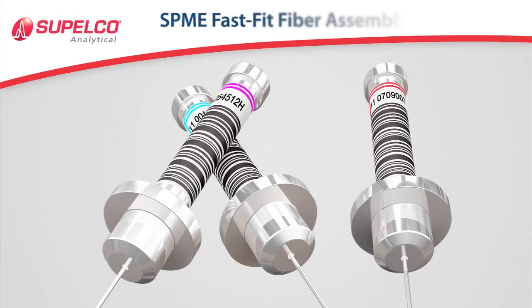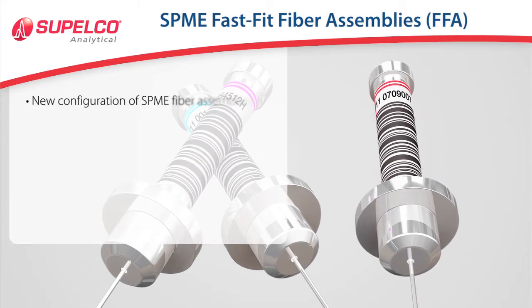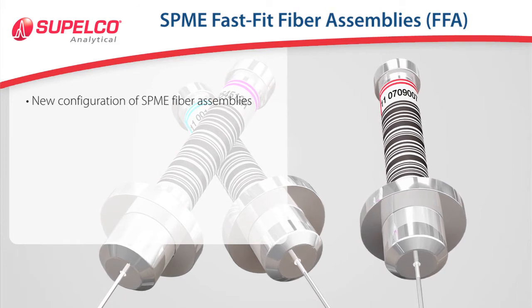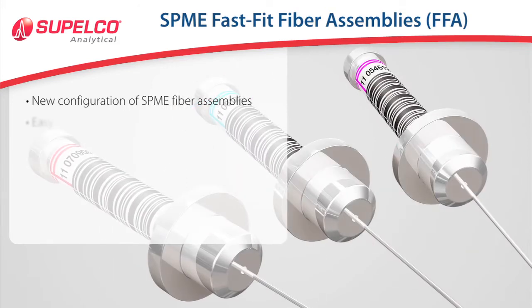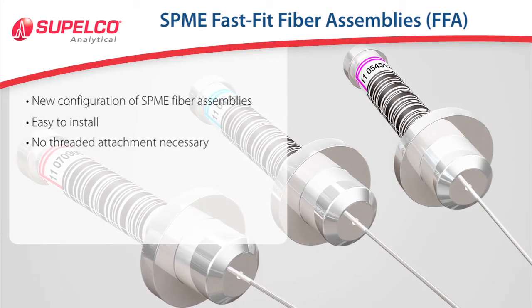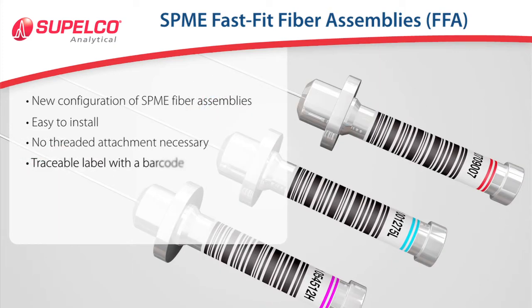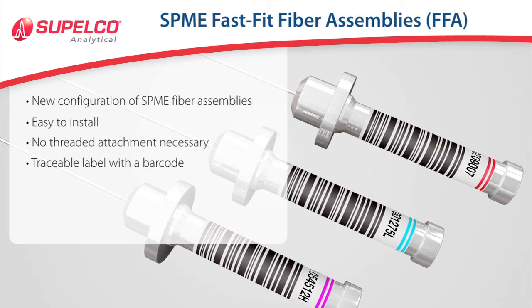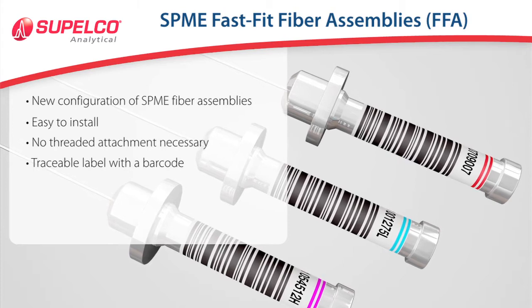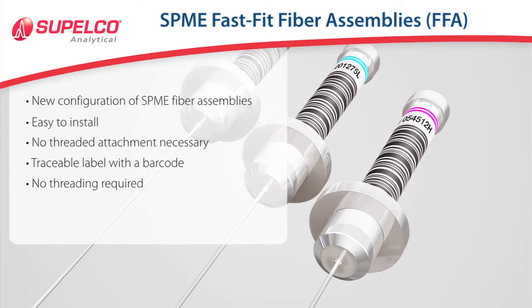The standard SPME fiber assemblies from Supelco are now complemented by a new configuration called the Fast Fit Fiber Assemblies, or FFA for short. These SPME fibers are easy to install with no threaded attachment necessary for the fiber holder. In addition, the SPME Fast Fit assemblies have a traceable label with a barcode. The new Fast Fit assembly has no threaded hub, so it doesn't require threading into the SPME fiber holder.